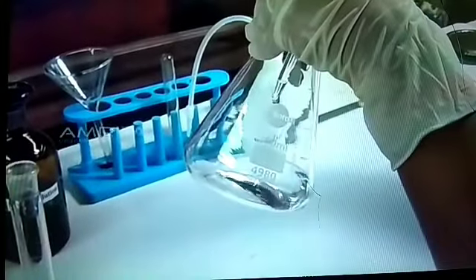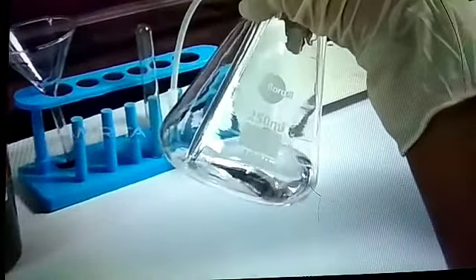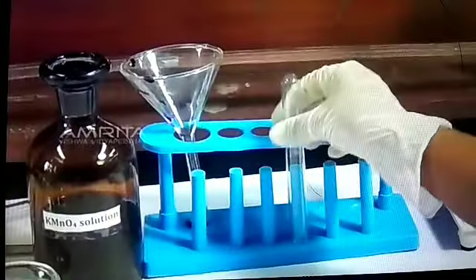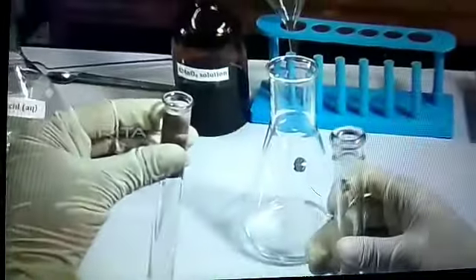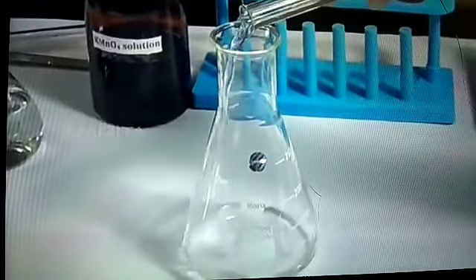Carefully transfer the 20 ml oxalic acid solution into the clean conical flask. Touch the tip of the pipette with the bottom of the conical flask to transfer the remaining solution from the pipette. Now add about 20 ml, which is the test tube full of dilute sulfuric acid, to the oxalic acid solution in the conical flask.